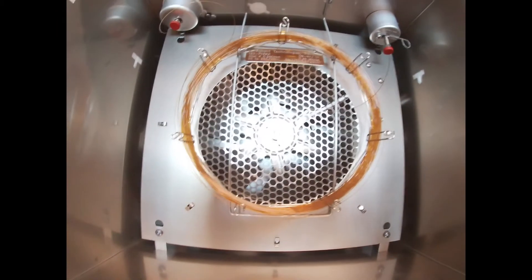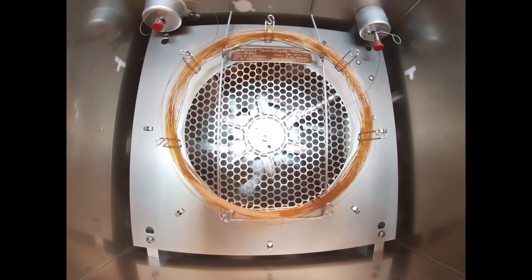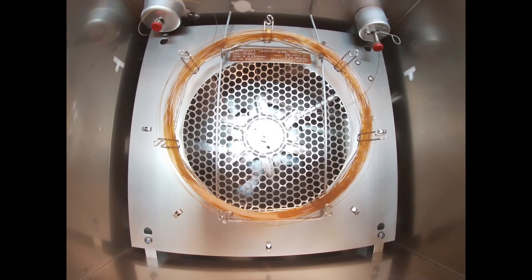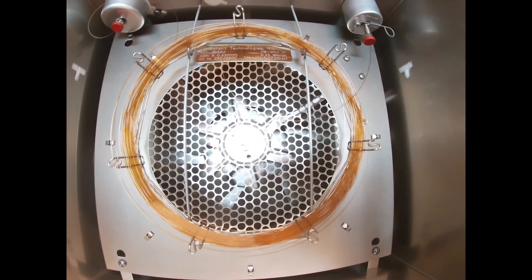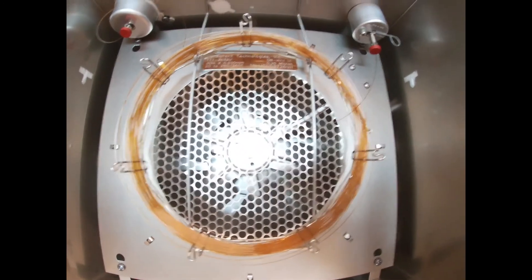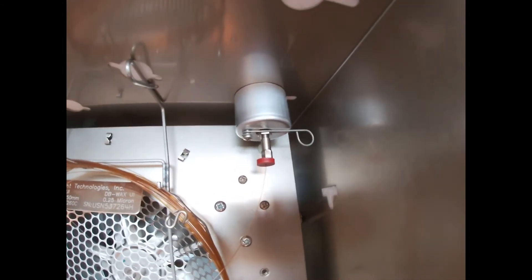30 meters, this is 0.2 millimeter diameter, this is a Carbowax column so it is slightly polar. We actually use it in a whiskey lab that we do to analyze some of the components in whiskey, and then we come up here where we exit our column.